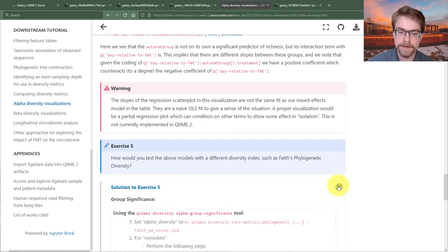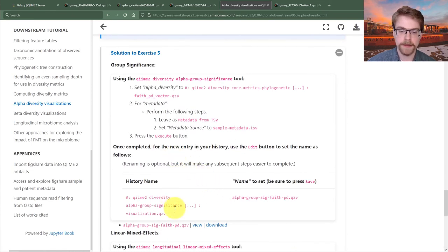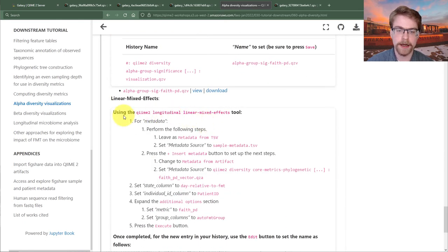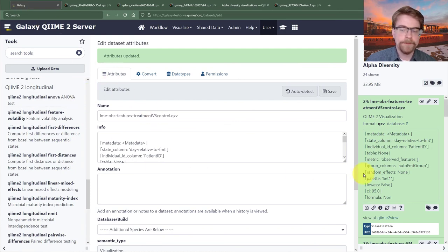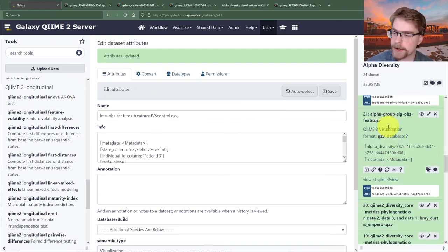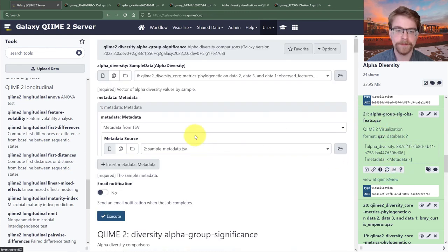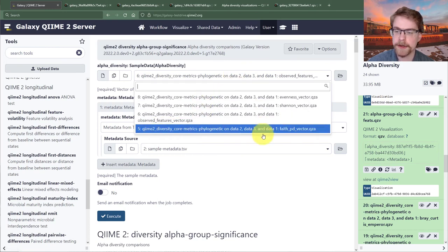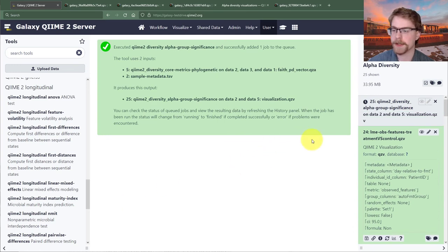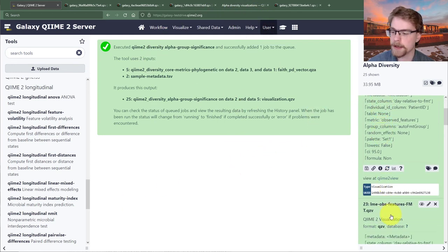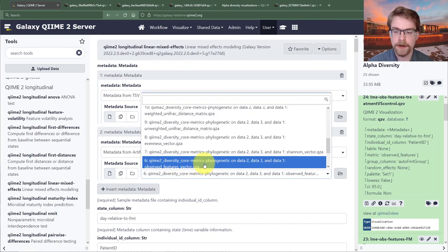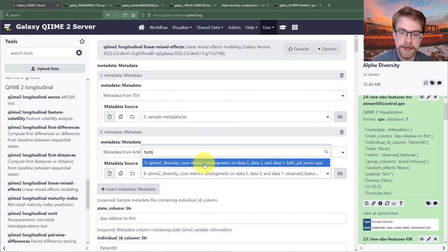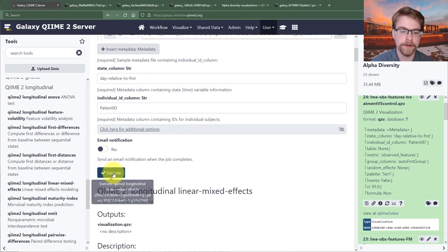If you weren't able to figure it out, the solutions are here. I'll go through the group significance at least and skip going through the linear mixed effects again. Going back to Galaxy, I'll scroll down and find the alpha group significance — a good thing we renamed these — and rerun it. Instead of observed features, I'll select Faith PD and execute. For the more complicated model, I'd rerun the LME and change the metadata artifact from observed features to Faith PD, then rerun.